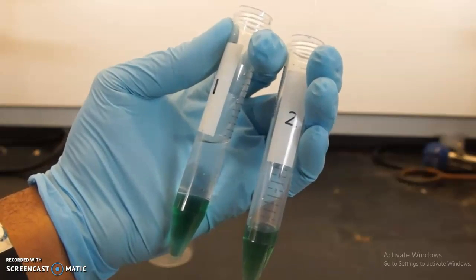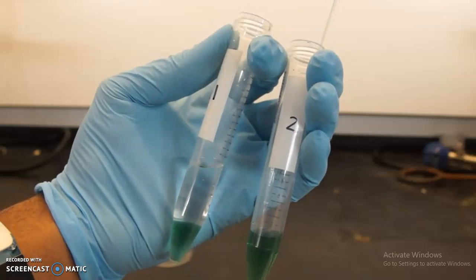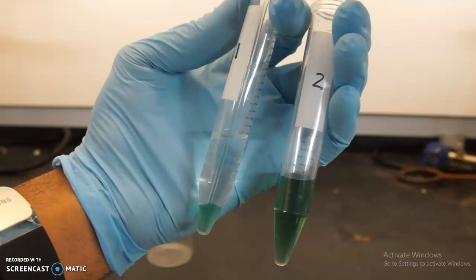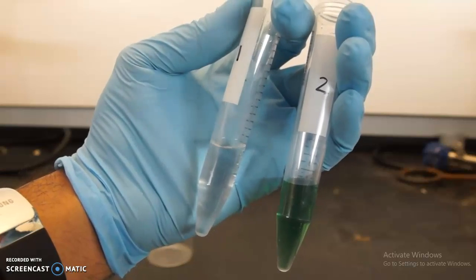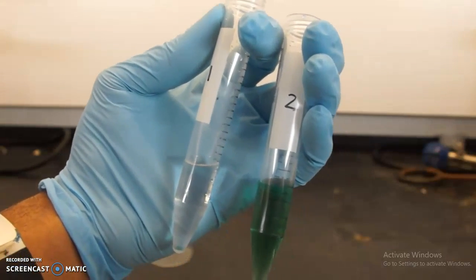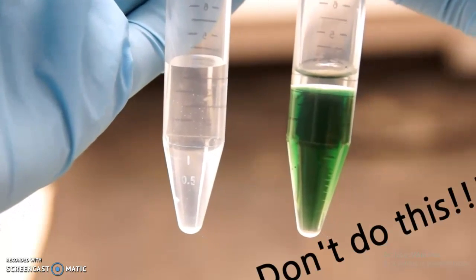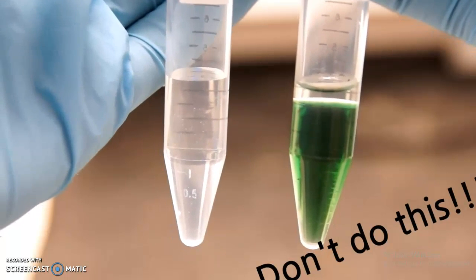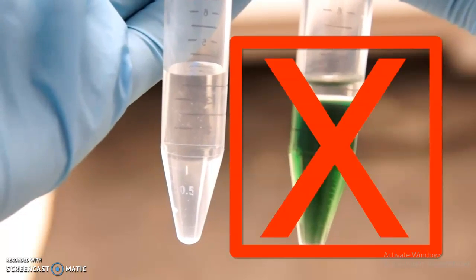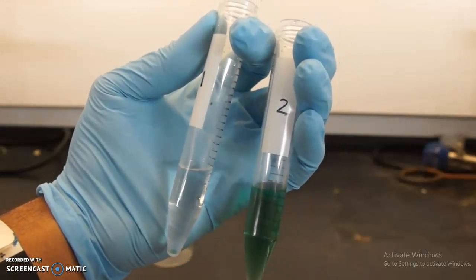So do this with precaution because you might actually take the colorless layer as well, which is not desired in this case. If you do this correctly, you should see only one layer in the new Falcon tube. Here's an example of what not to do. On the right, there is an aqueous layer with some organic on top. You want to try and separate the layers as much as possible and not bring organic along with the aqueous layer. Remember, we have to inject a homogeneous sample inside the instrument.